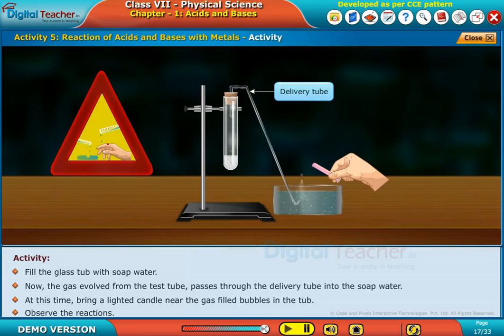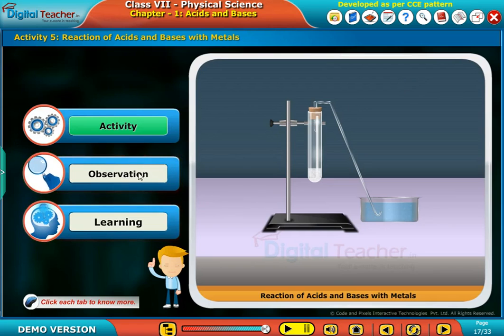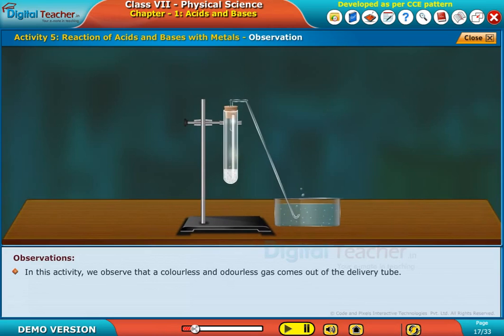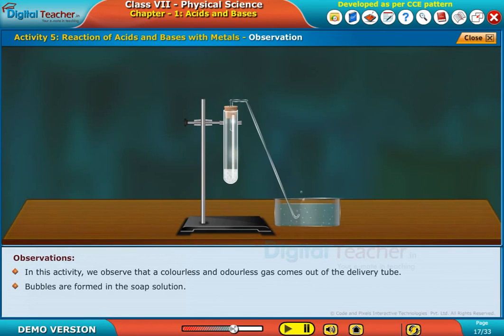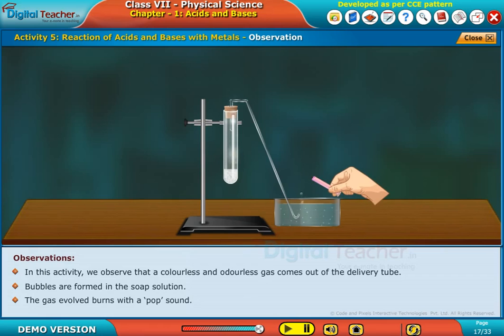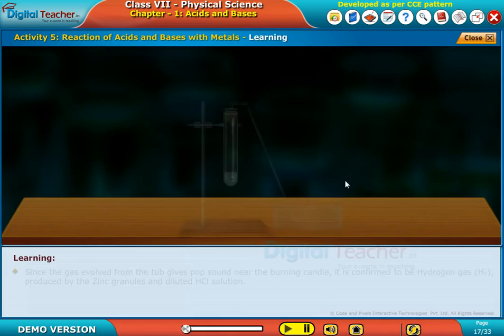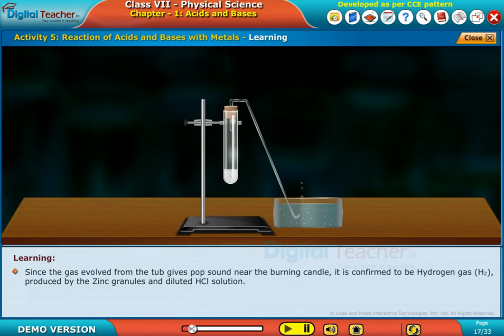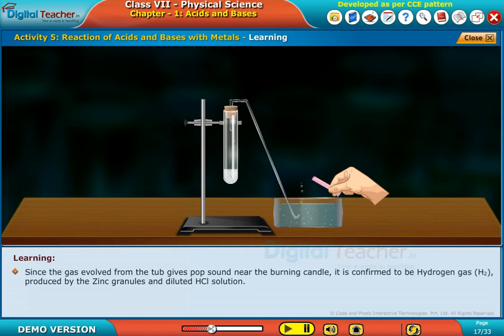Bring a lighted candle near the gas-filled bubbles in the tub and observe the reactions. Make a note — be careful while handling acids. In this activity, we observed that a colorless and odorless gas comes out of the delivery tube, and bubbles are formed in the soap solution. The gas evolved burns with a pop sound.